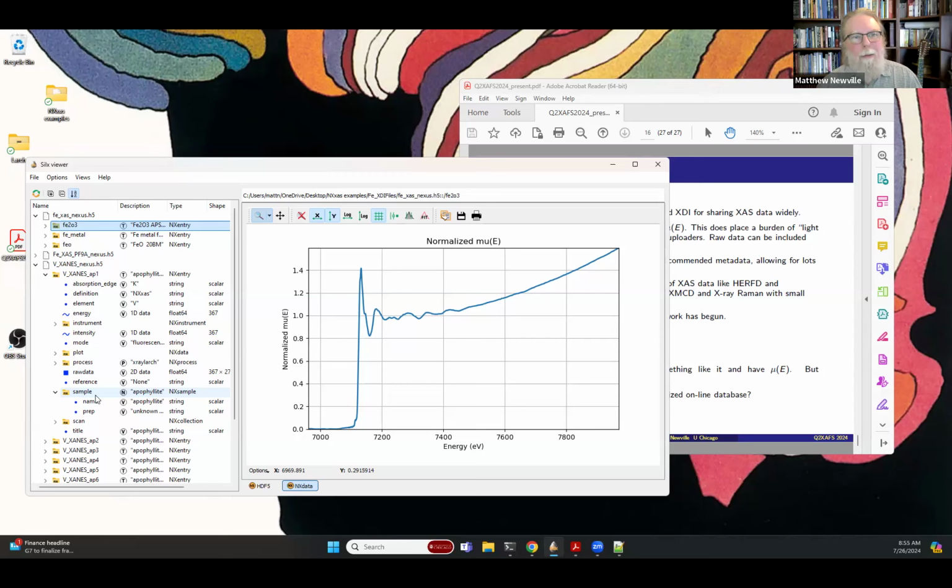I think I might suggest that, if you do processing on one of these groups, do you want to overwrite this group, or write it someplace else? I might say that you could have that be a subgroup of these, but I don't know that that's the best workflow. All those are actually possible, which is nice. Links, yeah. As I'm sure you know, Konstantin, links that are external can break. So internal links are better and subgroups are good.